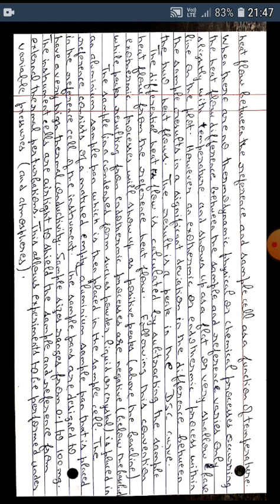The sample is placed in an aluminium sample pan, which is then placed in the sample cell. The reference consists of a matched empty aluminium sample pan that is placed in the reference cell of the instrument. The sample pans are designed to have a very high thermal conductivity. Sample sizes range from 0.1 to 100 milligrams.